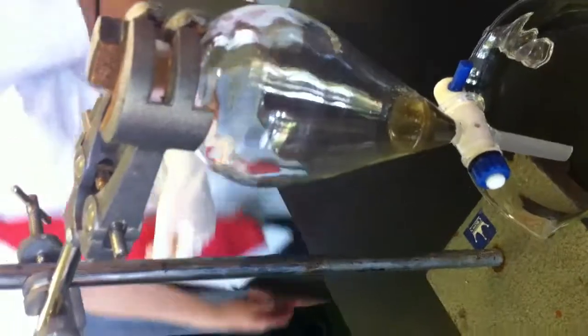It's enough. What are we adding to it? Sodium carbonate, anhydrous. Senior chemistry only. Open it, and then add some water and then just... Yep, okay, that's enough. Close it.